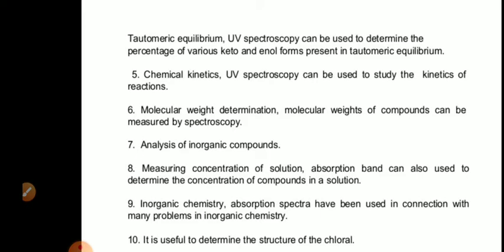As I told you, purification monitoring can be done. Whether the compound is contaminated, whether it is pure or impure, can be checked by spectrophotometric analysis.